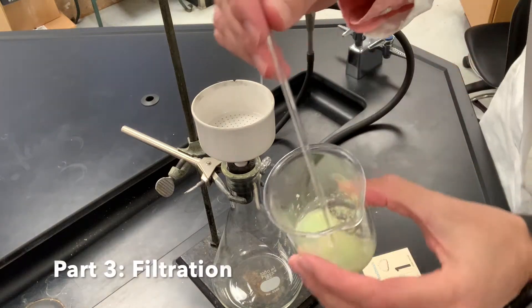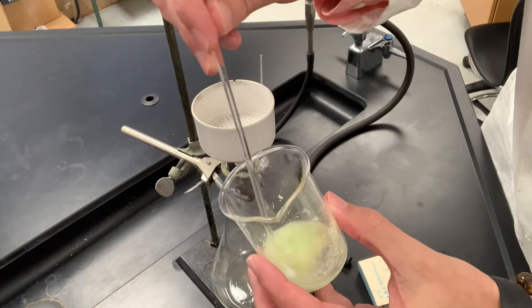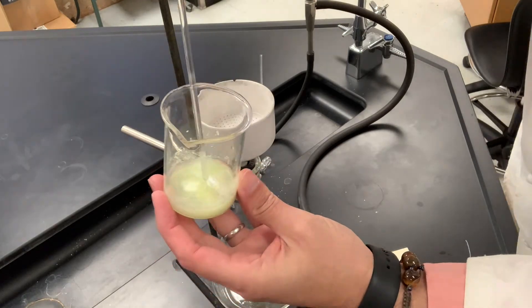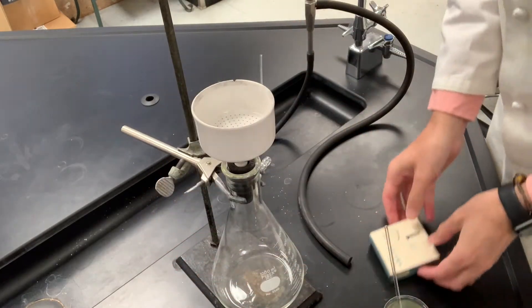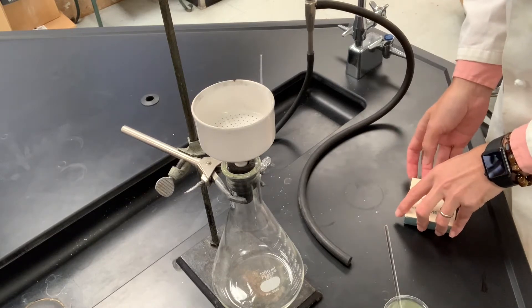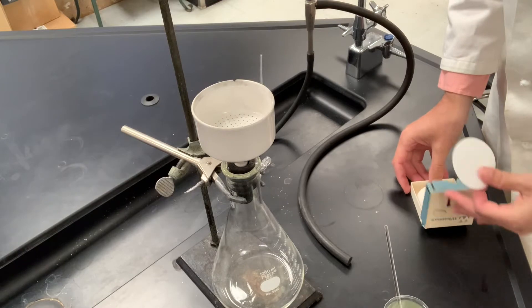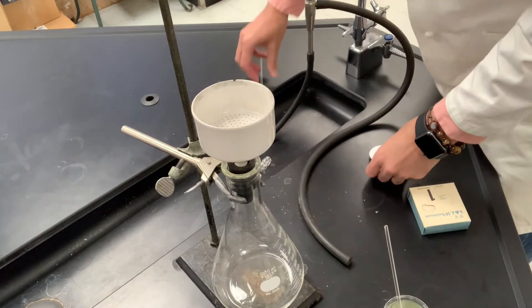Alright, we have this cold copper acetate catalyzed oxidation of benzoin reaction here and we want to filter the benzil, which is that light yellow color. We'll take a piece of seven centimeter filter paper here and gently get some water on this to wet it, cover the holes here.